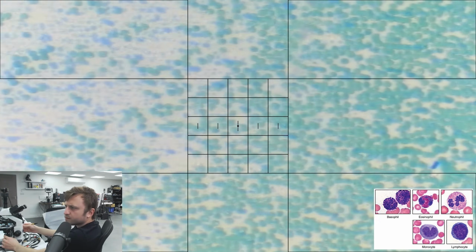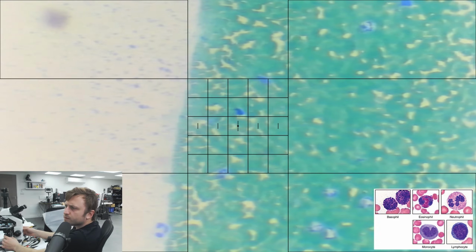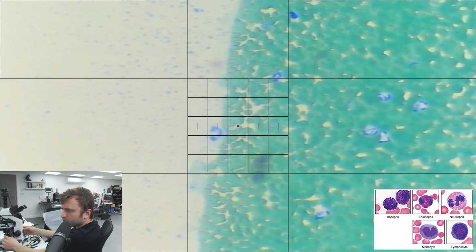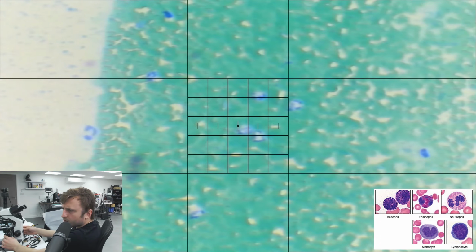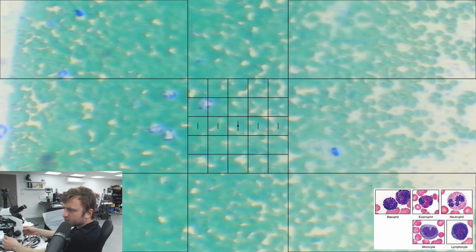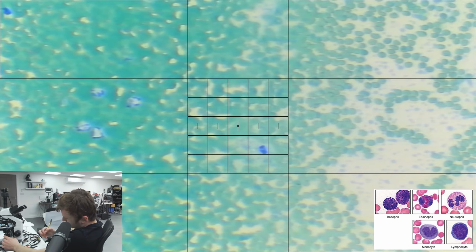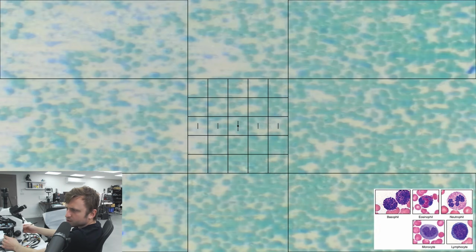Neutrophil, 85, unknown below. That's debris above the focal plane. Clumping, unknown. Whatever that one is, it's bigger than the others. I don't know what to make of this area. 1, 2, 3, 4, 5, 6 unknowns. Okay. Maybe lymphocyte? Malformed? Unknown again. This has been an interesting unknown region, that one.